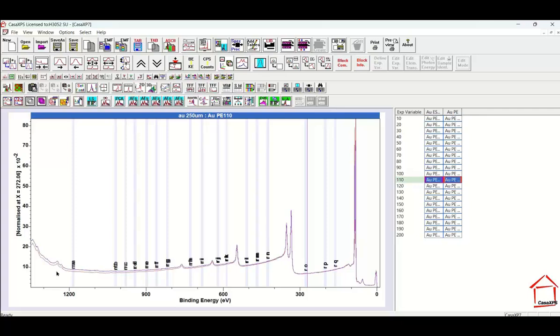You can see over here how the spectra are deviating, so they're not entirely equivalent. So how will we go about constructing the transmission curves that will fix it so that they both produce the same answer? If we get the same shape from our goal spectra corrected for the transmission, then we should get the same quantification. And as it stands, it looks like the one is not performing with the same efficiency as the other at lower kinetic energies, higher binding energies.